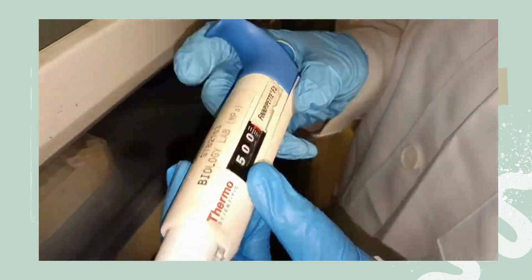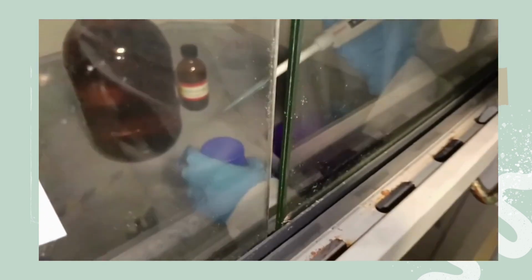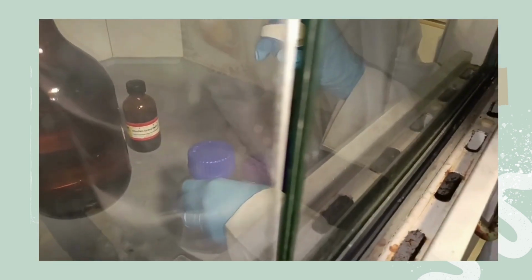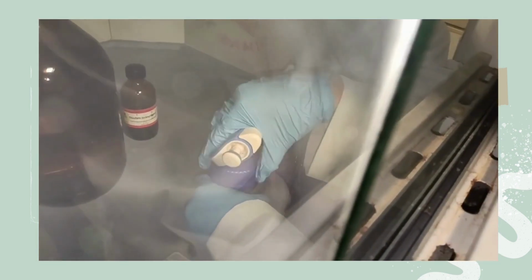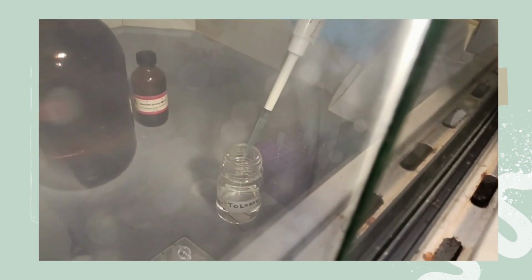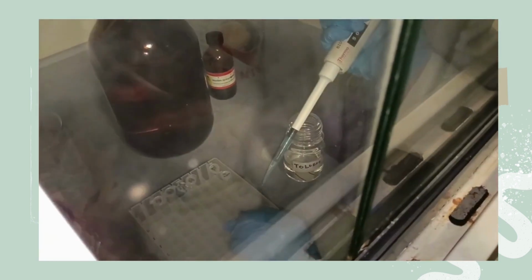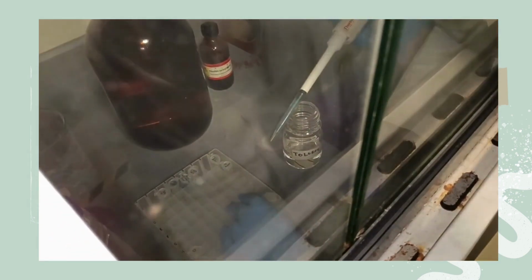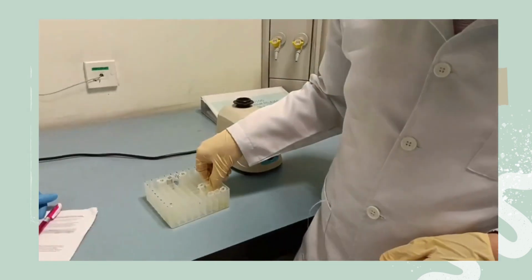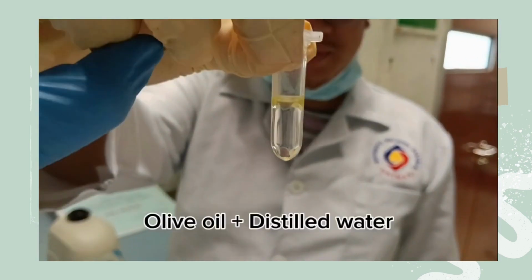For the second set, solubility in non-polar solvent, 0.5 ml of toluene was added to each sample. The tubes were capped and shaken to mix. The appearance and smell of the samples in the microcentrifuge tubes were all observed and recorded. The appearance of lipid mixed with polar and non-polar solvent is shown as follows.